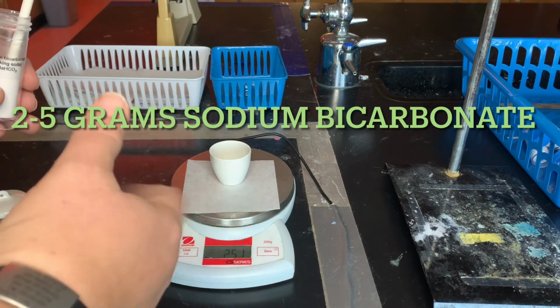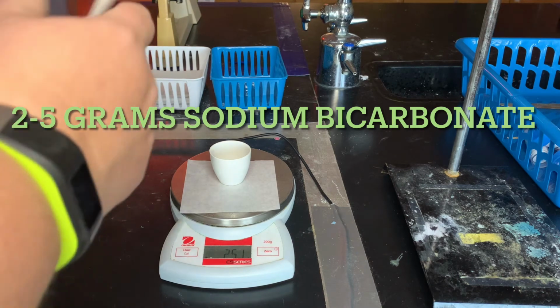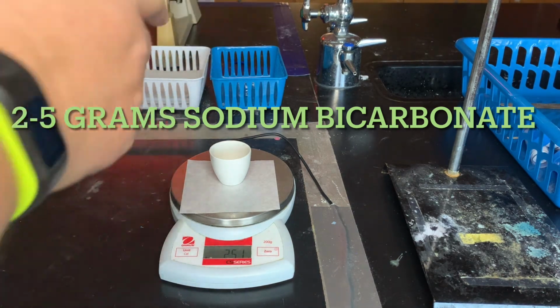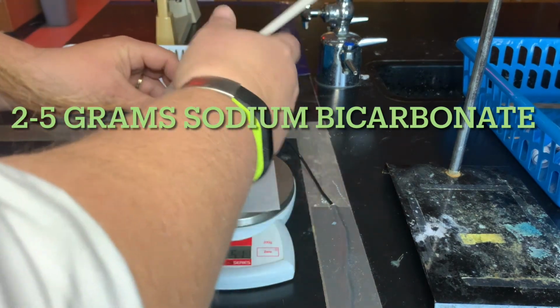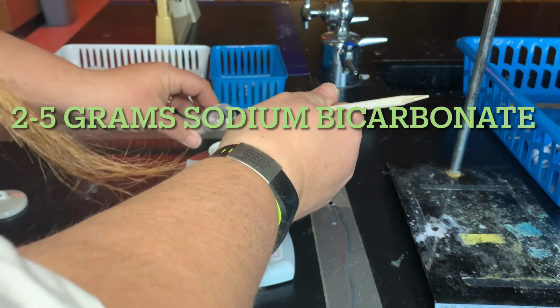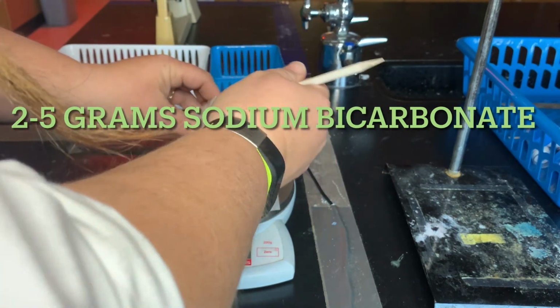That's fine if that's easier for you. But I'm going to put in 3 grams, which is the same amount that I worked with in the both test tubes beforehand. So if I'm at 25.1, I need 28.1.